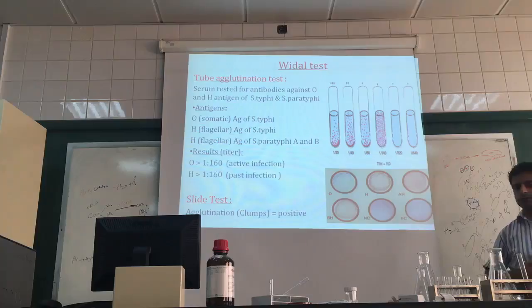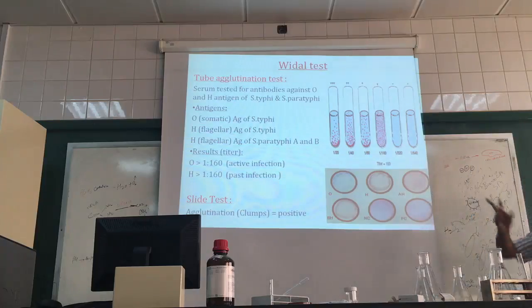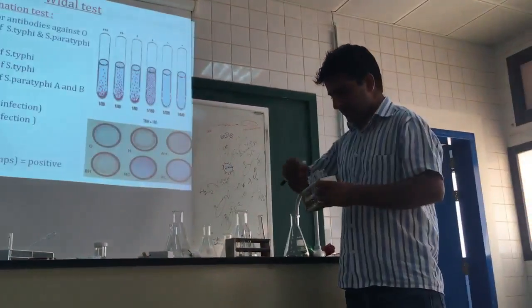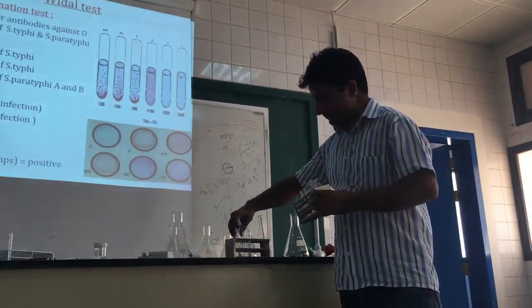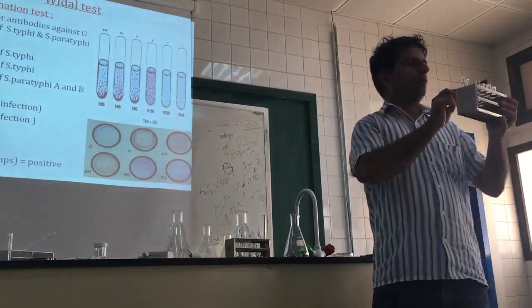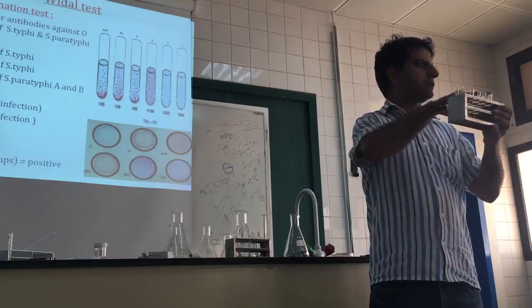What is the serial dilution? I will tell you about this and remember it for all. One method is for all serial dilutions. I will start from here, okay? 1, 2, 3, 4, 5, 6.